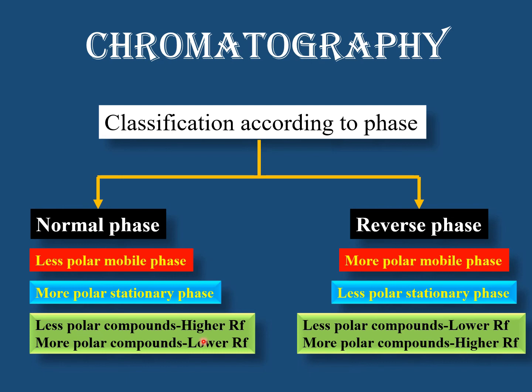In the next sessions, we will talk about the different chromatographic techniques used for analysis or purification of different components of a mixture.